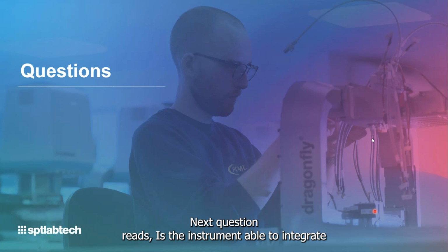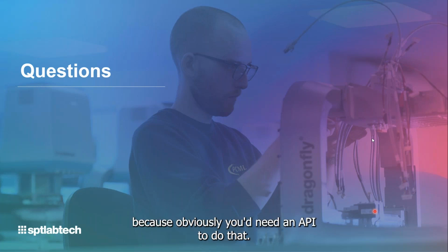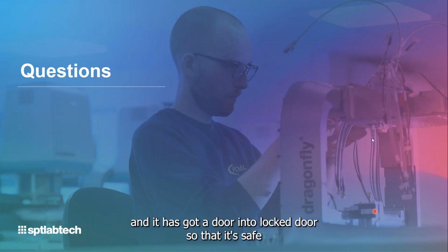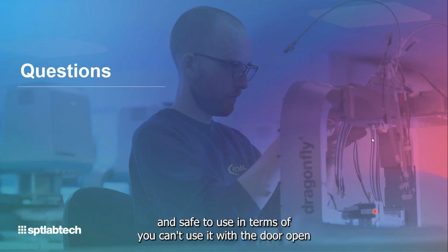Our next question reads, is the instrument able to integrate to a high throughput process with robotic arm access, for instance? I'll take that one, and that leads nicely on from the previous question, because obviously you'd need an API to do that. Essentially the system as a standalone system is designed to be used enclosed, and it has an interlocked door, so that it's safe to use in that you can't use it with the door open. Also, that prevents any kind of airborne contamination from entering the system.